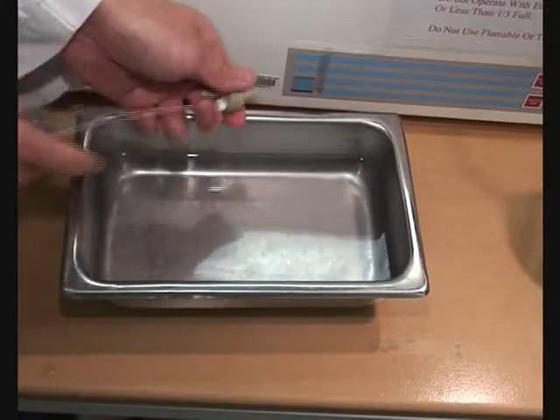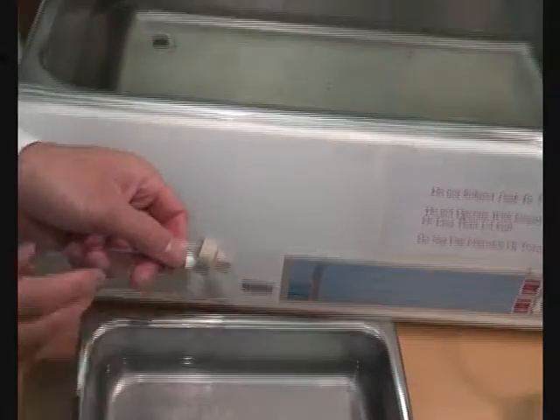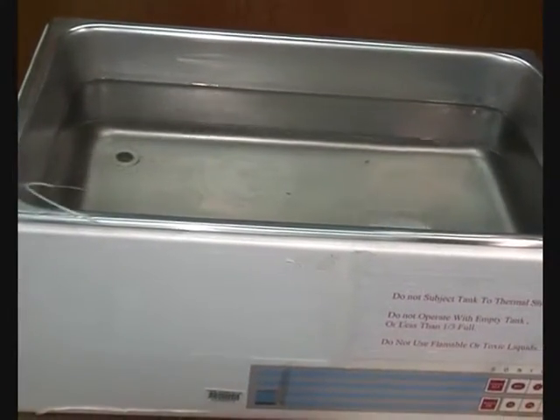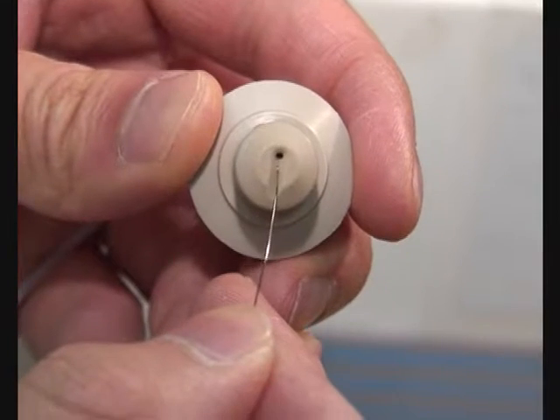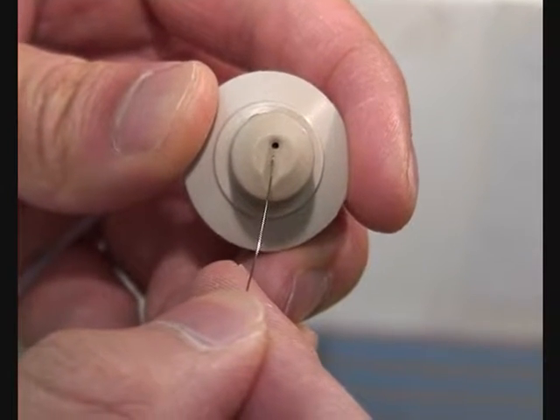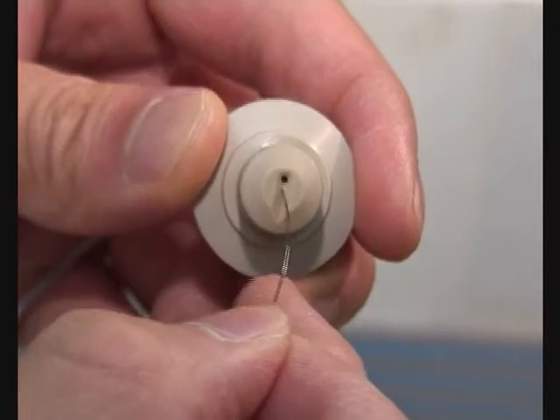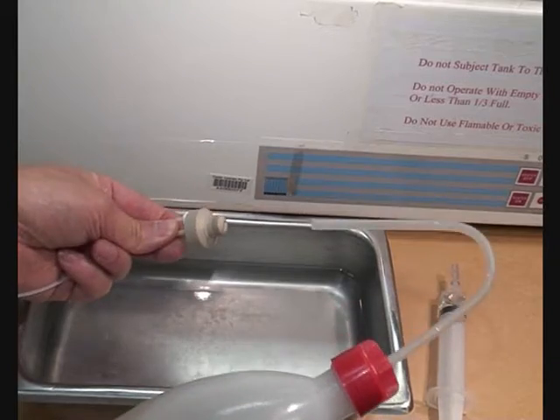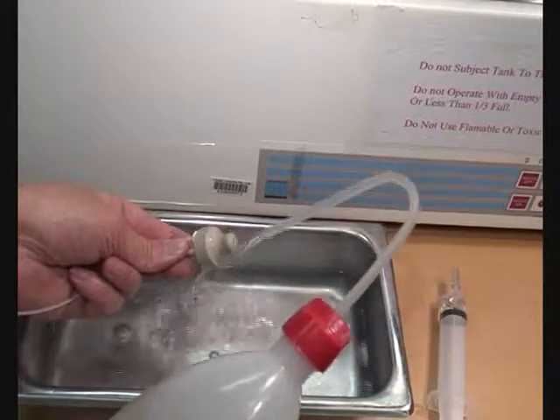If this does not remove the blockage, place the nebuliser in an ultrasonic bath for 2-3 minutes or until clean. A last option is to gently probe the gas orifice with the wire probe provided. Wash the unit thoroughly to remove the source of the blockage.